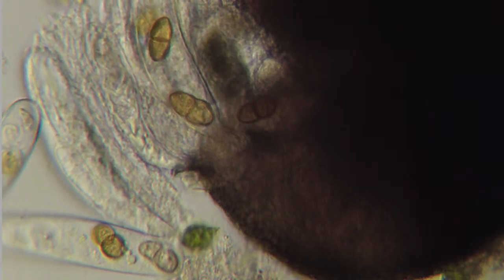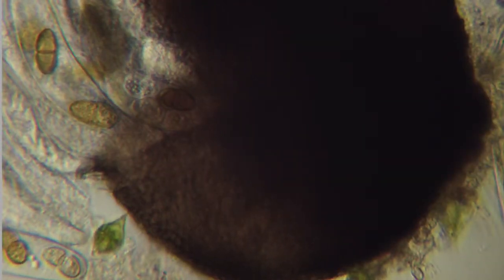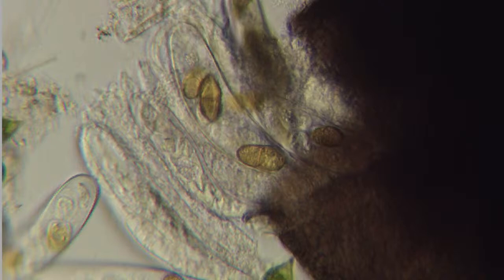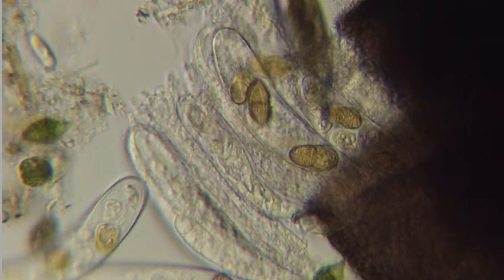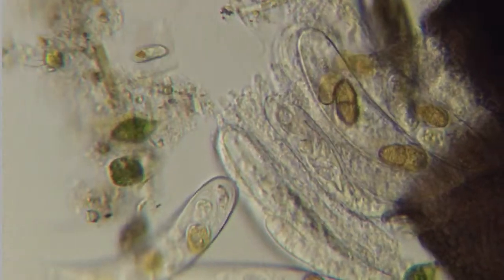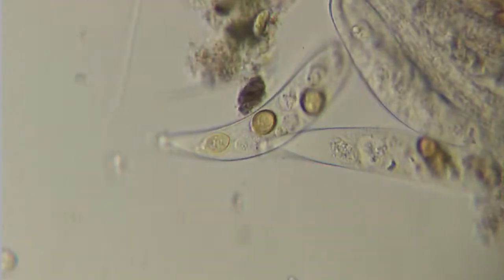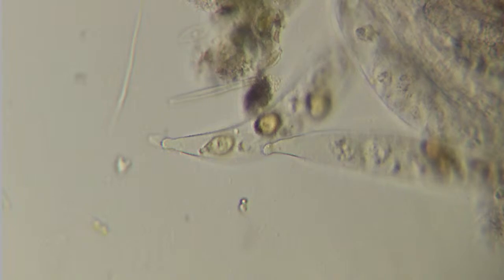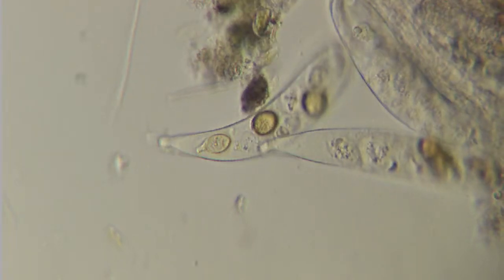So this looks like, oh yeah, look at it, stuff's coming out. So it looks like this ruptured. This is some kind of a fruiting body of something, and it's ruptured and all the contents are coming out. Almost like a spore of some kind, but it's ruptured and all these little guys are oozing out. Little banana shaped thing. See that little tip there? It's like a bulbous tip, like the top of a banana. Interesting. Never seen this before.